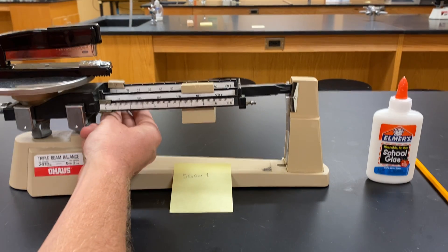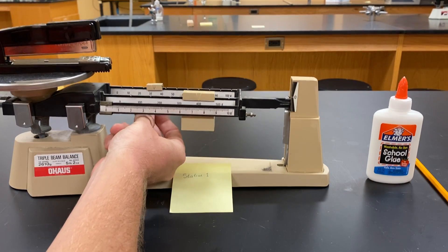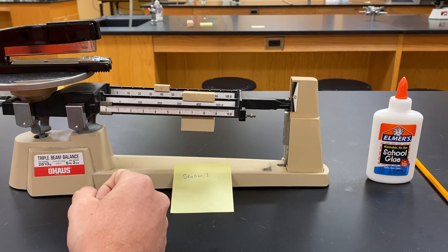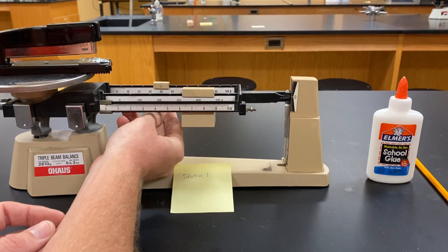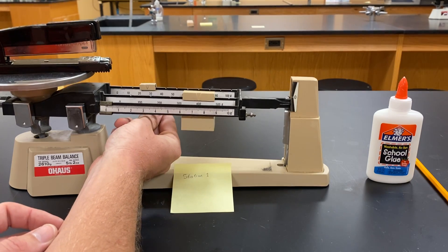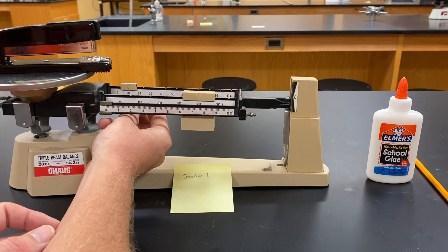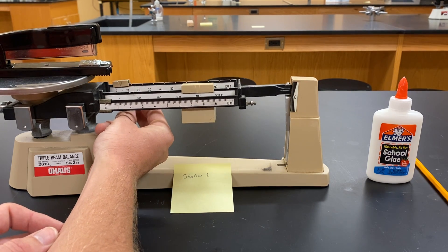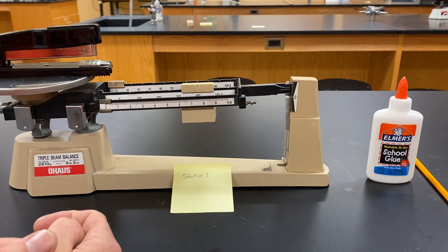Now we're going to move over this medium-sized weight until the arm drops. It's got too much weight at 40. Back to 30. Back to 20 is still too much. 10 is also too much. We're going to leave it at zero.